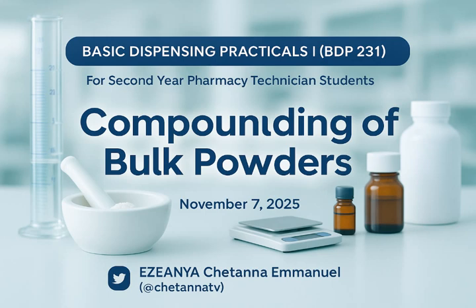Okay, when we are doing our own practical, can we just assume to use something? Like you said, since 0.1 is too big, it's like wastage of ingredient. You said let's just use 0.08. So can we also do our own like that? Before you do anything, there are two things you put into consideration. Ingredient wastage, number one. If I want to let anybody to come here and waste ingredients, we don't have enough. You think of ingredient waste.